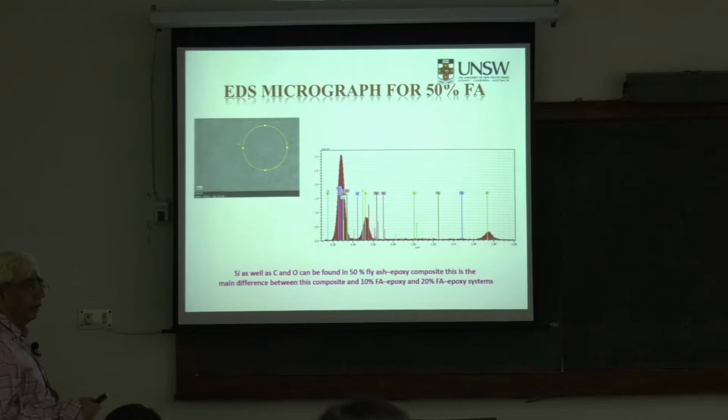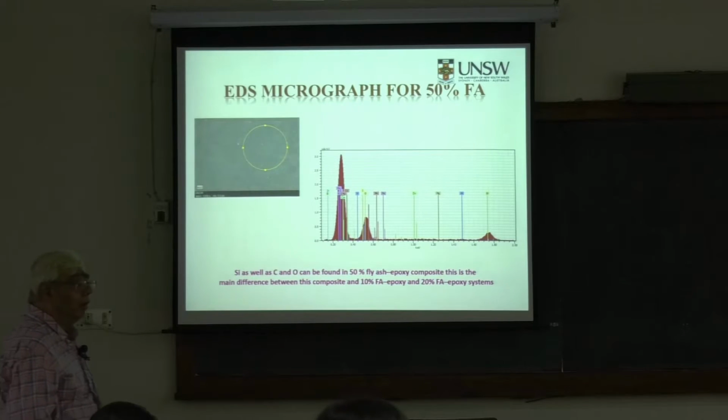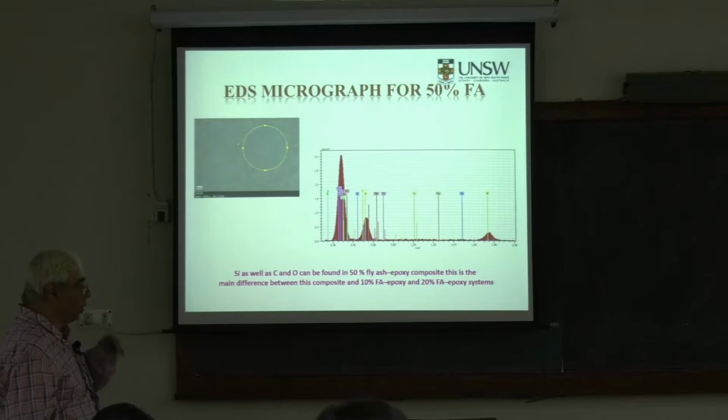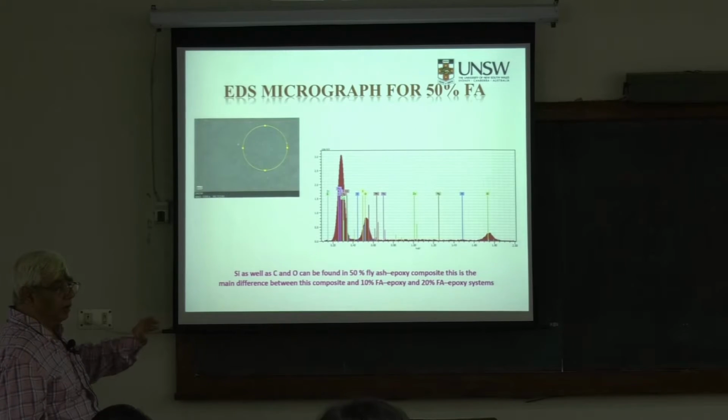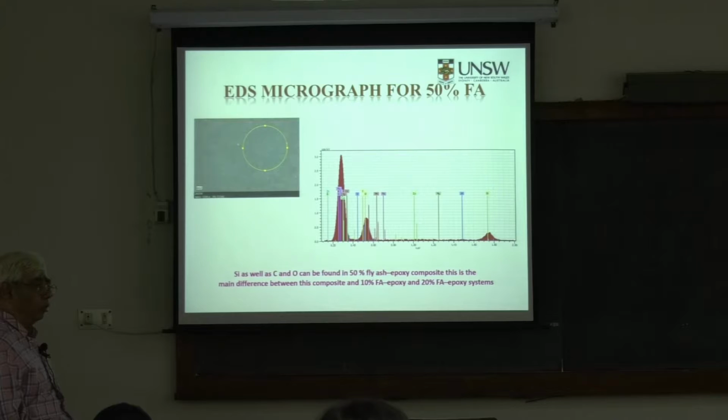But you say in EDS gold coating is done, is it? Have you got EDS equipment? So EDS gives gold coating. So you have the gold coating on the epoxy and the particles.